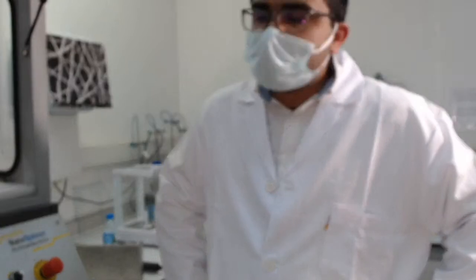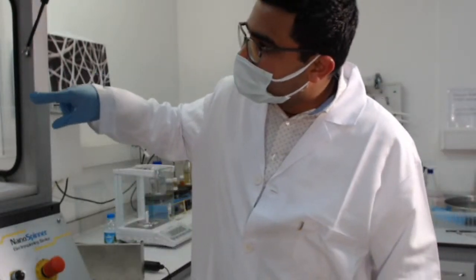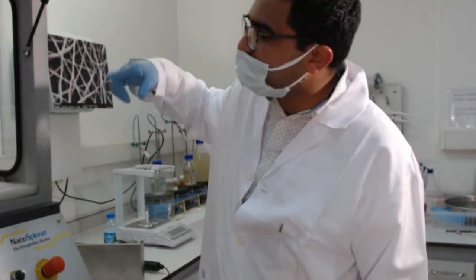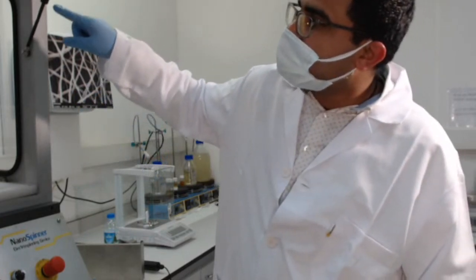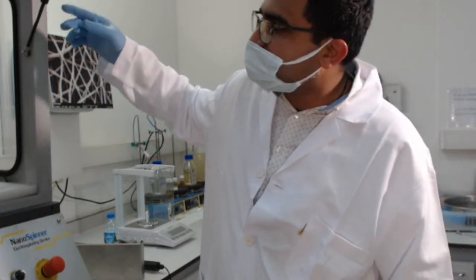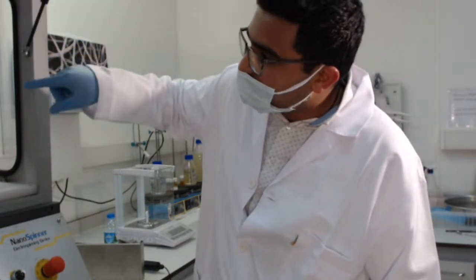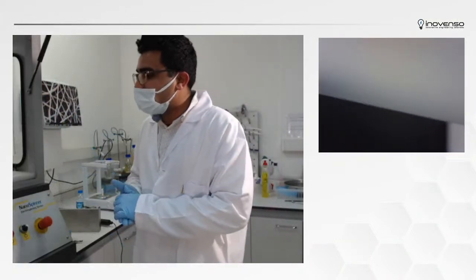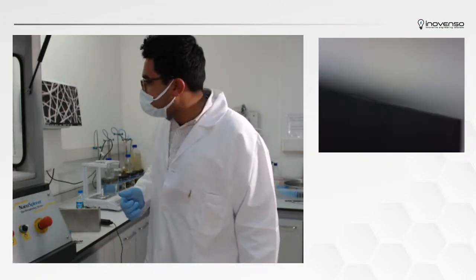So just to recap, there's a charged part, the anode, here, and there is a potential difference, like we discussed in the presentation. I should mention that the grounded electrode is basically at zero potential, and that's what's allowing the jet to go upwards. This is what's helping it to continue forward. So this is basically our process.